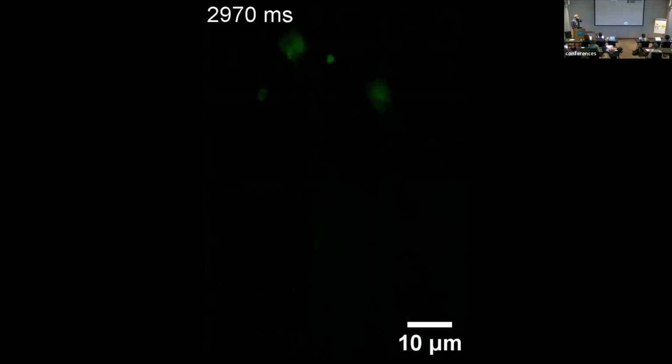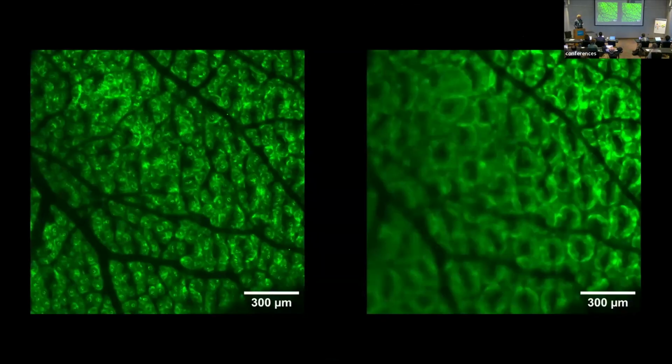But apart from it, when I was playing with GFP-tagged mice, where GFP was tagged to a junctional protein, I noticed at lower magnification that I look at not only crypts, but also slices of villi in living tissue, which is extremely cool because of whenever you think about the structure of villi and crypts.